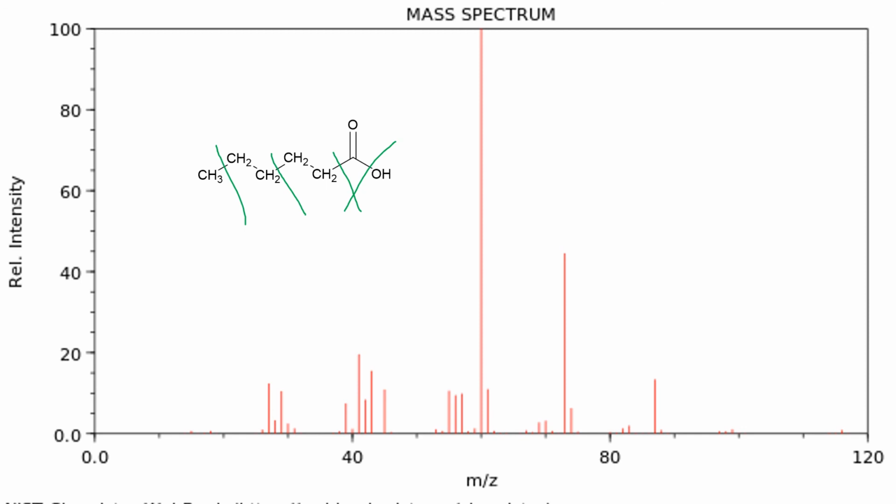So any place there is a bond, there is a possible break. And some of those breaks are more likely than others. For instance, a single bond, such as this one here, is more likely to break than a double bond, such as that one there. So your fragment that is this portion of the molecule is much more likely to happen than your fragment that is this portion of the molecule, because this one results from the breaking of a single bond and the other one results from the breaking of a double bond.